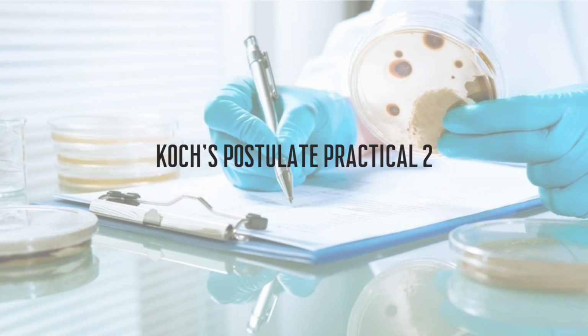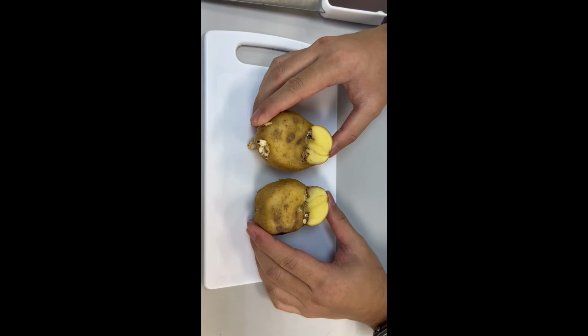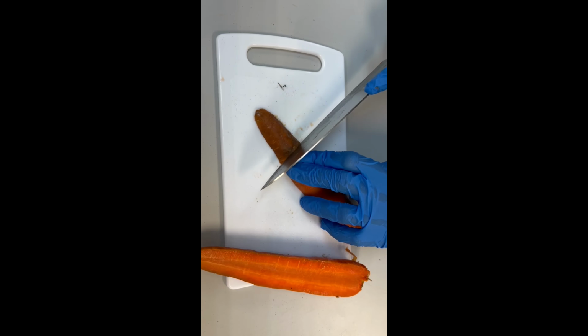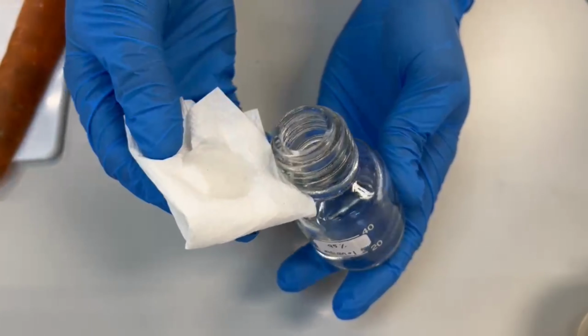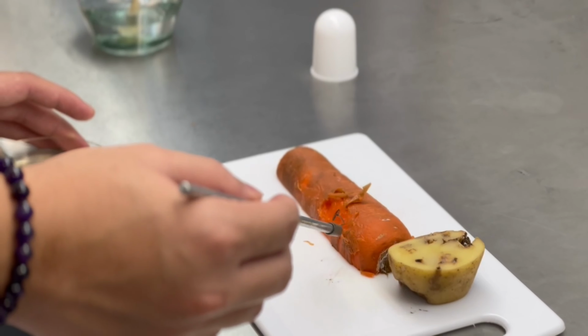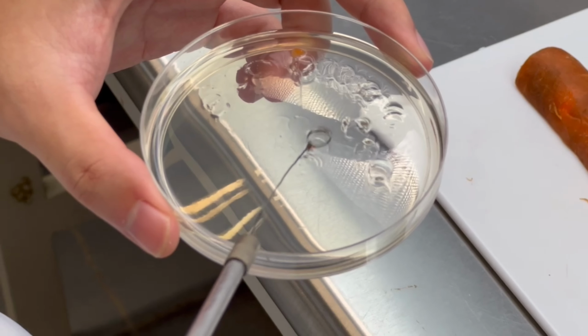Koch Postulate practical 2. The infected sample was sliced through and any changes in color and texture of the infected tuber were observed. A sterile inoculation loop was used to collect the infected carrot, which was then transferred onto agar plates.